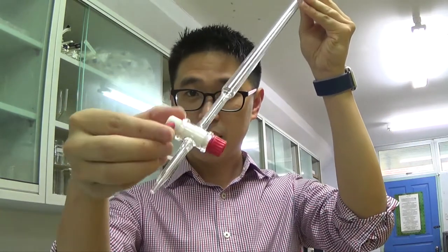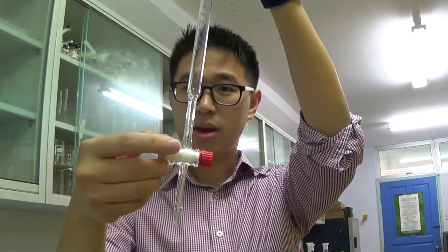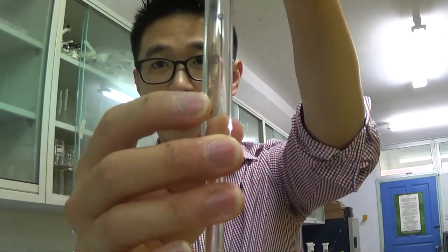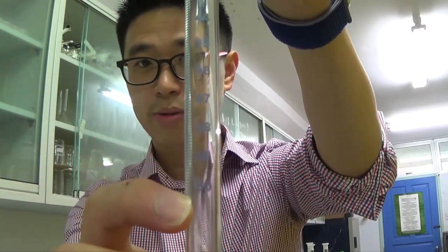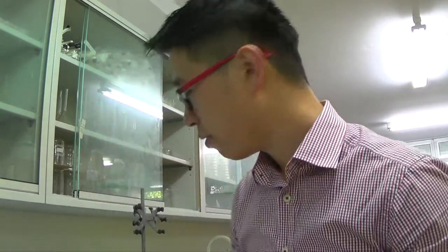In this tutorial video, I'll go through this titration experiment. So this is a burette. It's got this tap at the bottom that you can turn on and off, and this is where the solution will come out from. It's got graduated lines running from 50 to 0 at the very top, and you have an inlet at the top that you can fill the solution with.